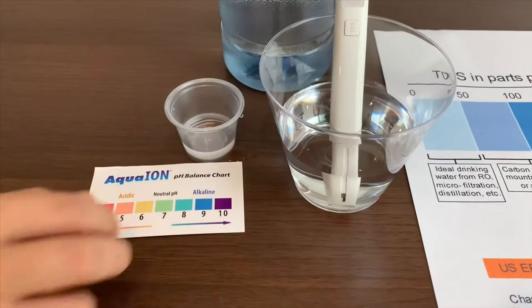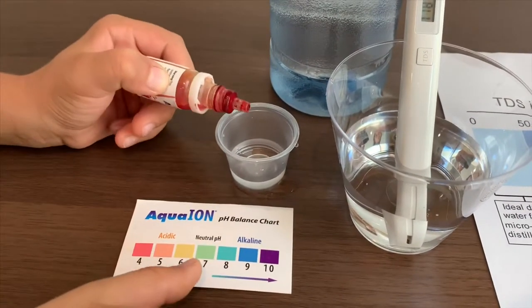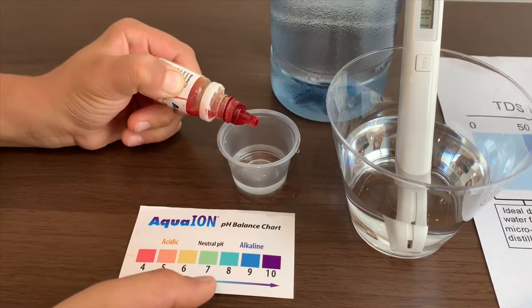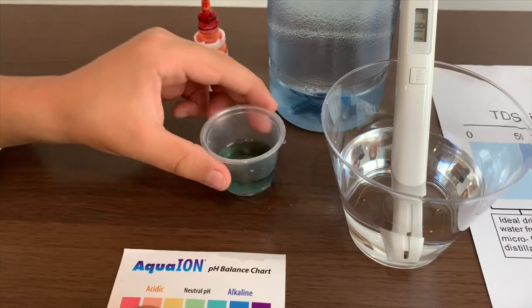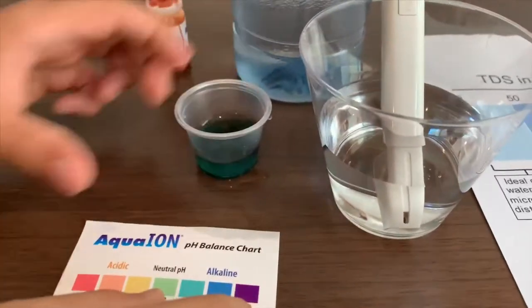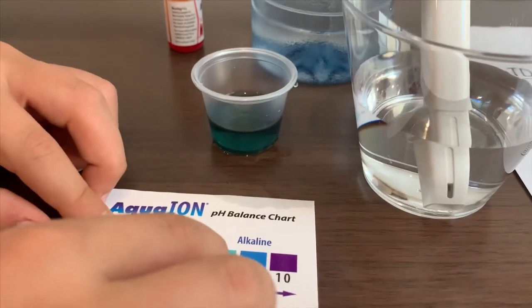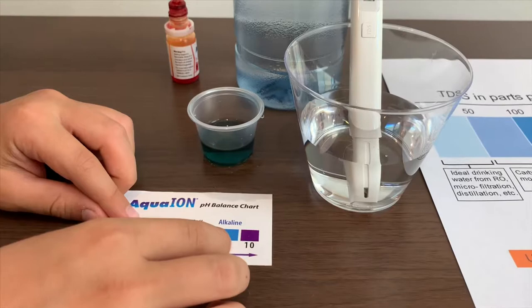Now let's test the pH. I will give this an 8. It is alkaline water.